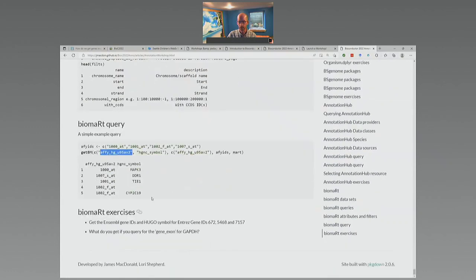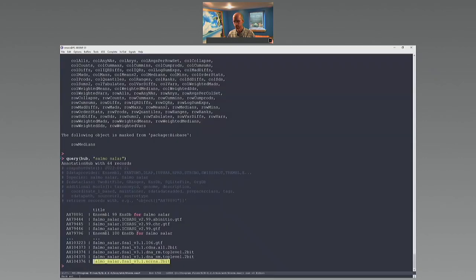Okay, cool. You can use select with biomaRt. I did not know that. Is that new, Jenny? Yeah, I think it's at the bottom of their vignette that they added that in, but you still need to do their attributes. You have to put it in both as a filter and an attribute to get it back out. Right, so their select is doing what select normally does. I don't know if the select reorders, but I just know that you don't have to. I switched over to teaching that: look, you use it with select and columns and keytypes and everything instead of getBM. I think it's at the bottom of the biomaRt vignette that they put that functionality in.